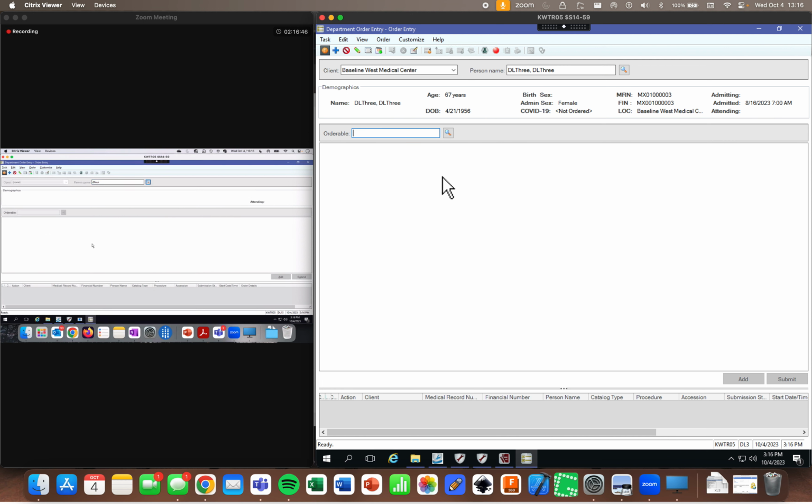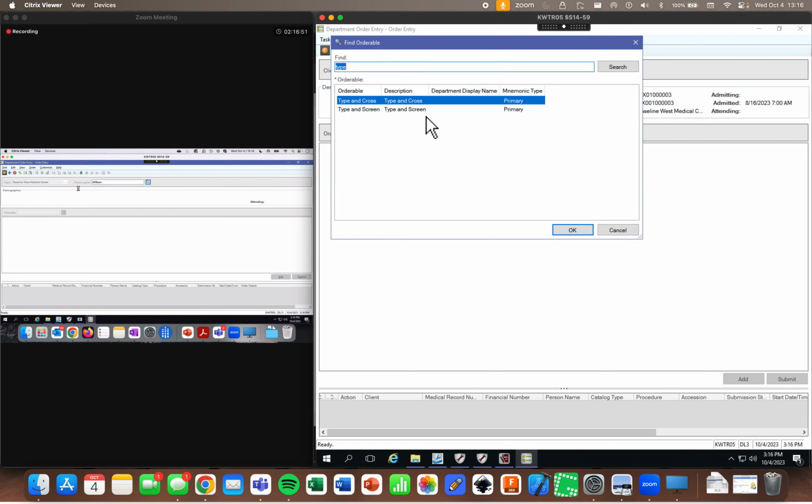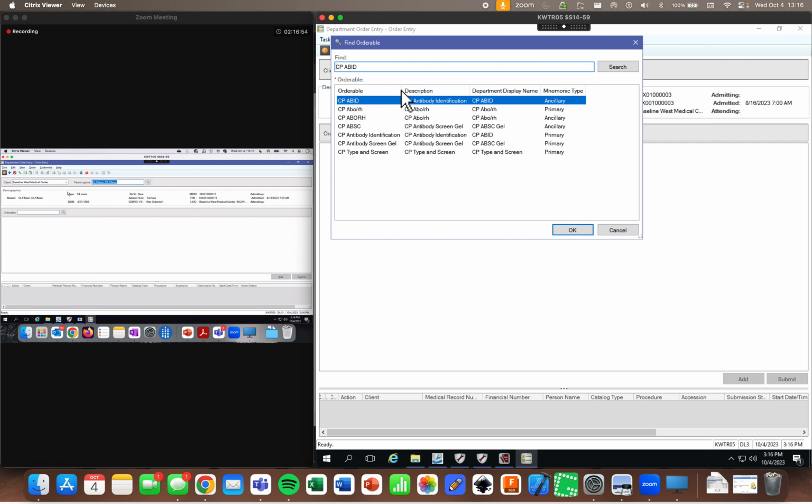Let's see, DL4. I was able to get them to appear right away. So you might try, if it's not wanting to work a second time, maybe try restarting the application. I know that in past versions of our code in our train domains, we've had issues where the search didn't want to work right, but I thought they'd fixed that a while back. So patient's definitely in there. It just seems to be a little bit of an application issue.